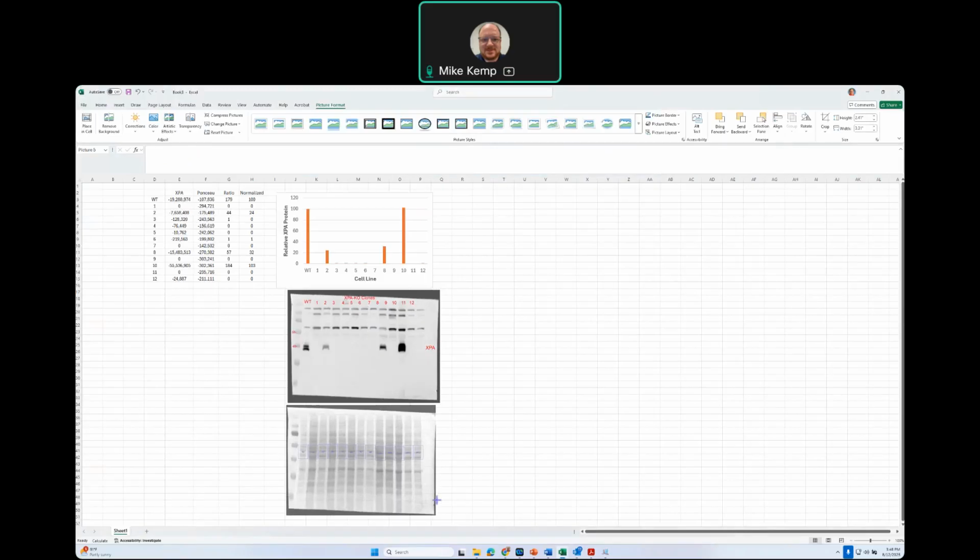So again, there's different things you could do. You could actually export a picture with the region of the boxes you've shown. I could have done the same thing with XPA actually. And that can be useful. Again, you can always save more files. But this allows you to, at one time, look at the graph and the original data.